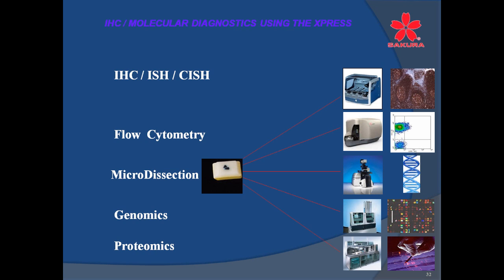I told him, this is one instance that you really want the cells to loosen from the slide, so you can mount them on another slide for other work. But anyway, microdissection is a neat tool, more along research, but I wouldn't hesitate to say that it would sneak into the surgical field in some capacity.